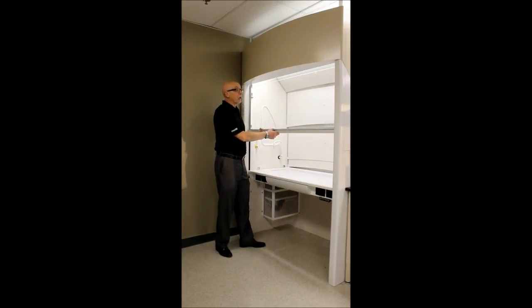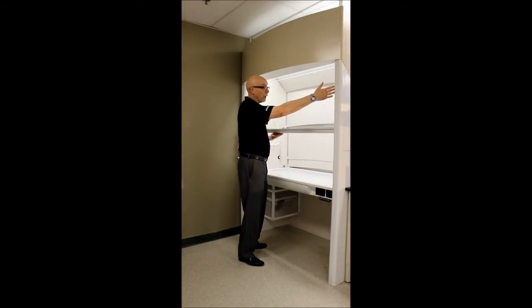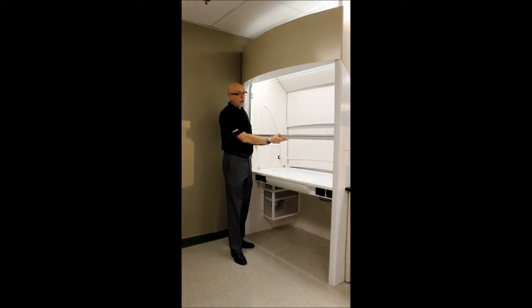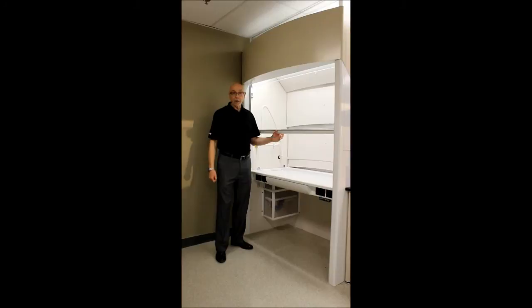When loading and unloading the hood, the sash will open all the way and there is a hook that will hold it in place. When using the hood for standard purposes, when you open the sash it will automatically close down to 18 inches so that you know you're operating in a safe modality. The suspension for the sash is chain and sprocket — very heavy duty, low maintenance — and gives the large sash a very solid feel.